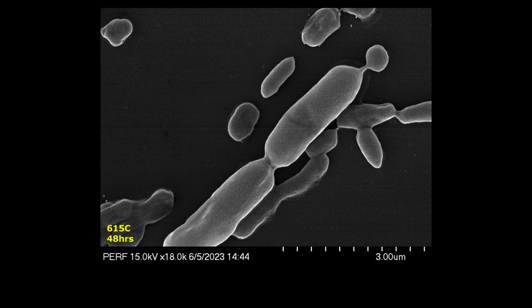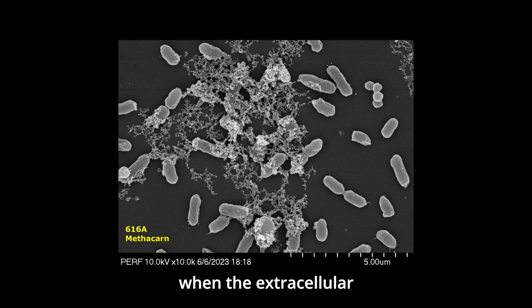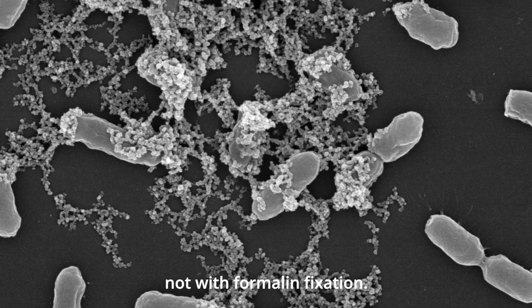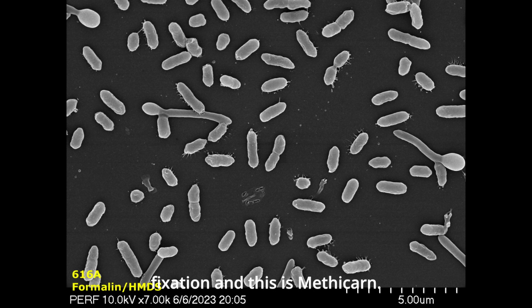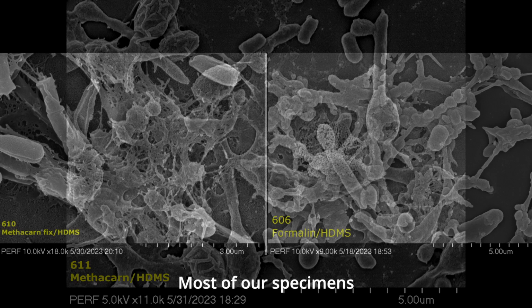When you use this alternative fixation that tends to preserve more of the EPS protein structures, you get an image like this. So you can see the tremendous differences when the extracellular proteins are preserved, which typically they are not with formalin fixation. Again, this is formalin fixation, and this is methacarn. So it does a much better job of fixing the EPS material and making it visible.